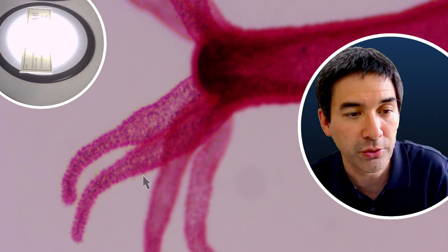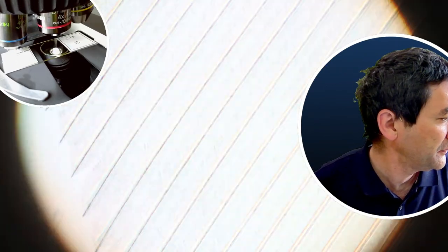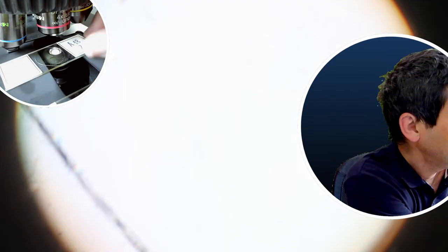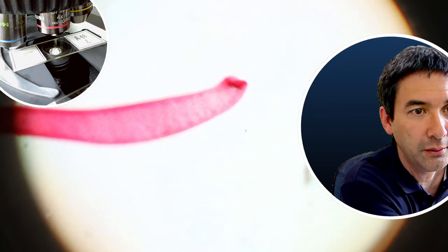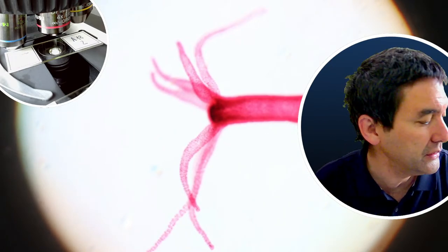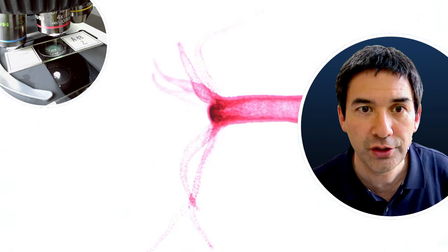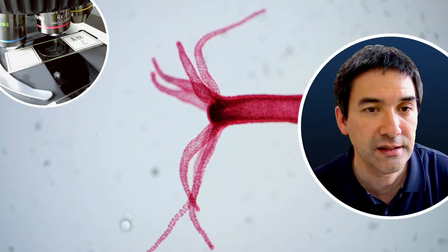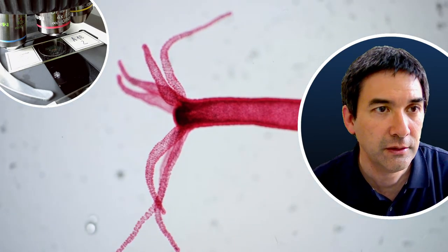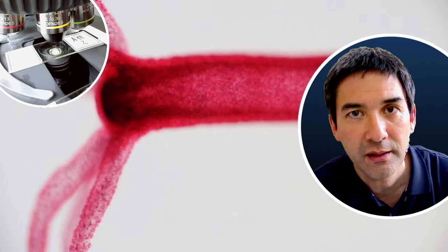Compound microscope. Let me put the feather away, put the dark field away. Using the 4x objective with the condenser removed, and then for the 10x I can put the condenser back. This is basically how it looks like using a 10x magnifying objective.